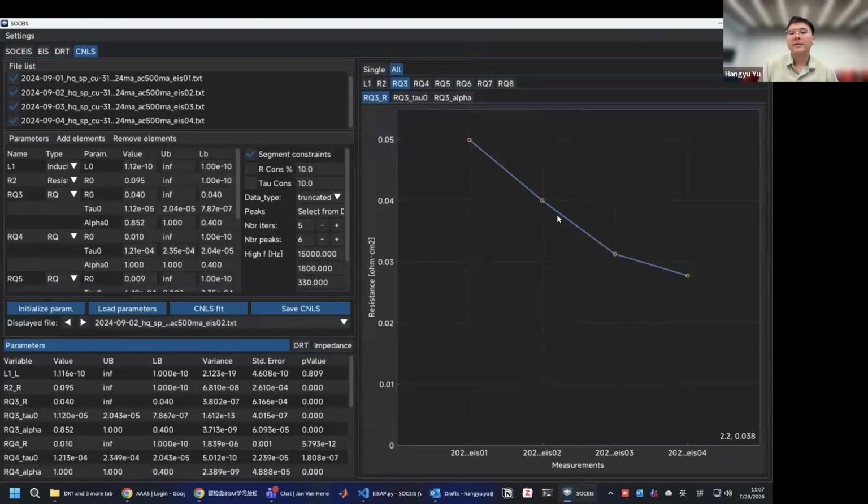But of course, this is not a scam, and we have to make sure that this won't be a scam. We have to choose and adjust the location of each point, of each measurement, of each fitting based on our knowledge, because we know that it should have a consistent trend instead of flying everywhere. So that's how we can derive a good fitting.